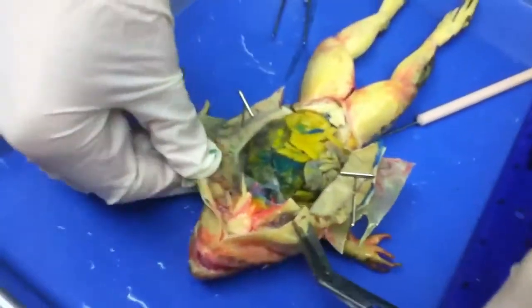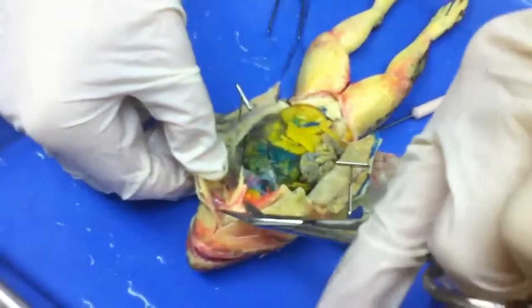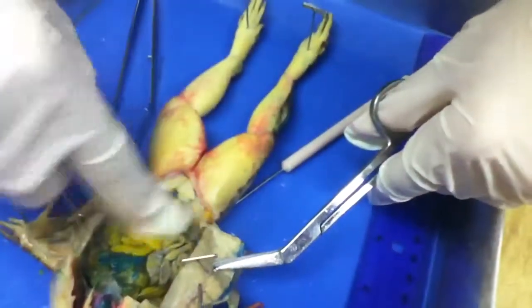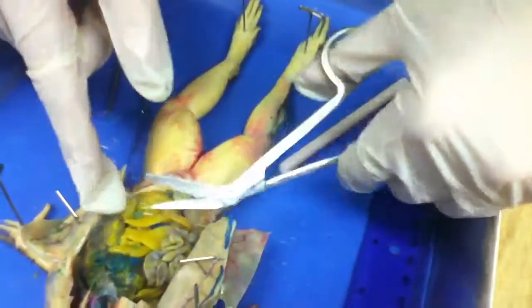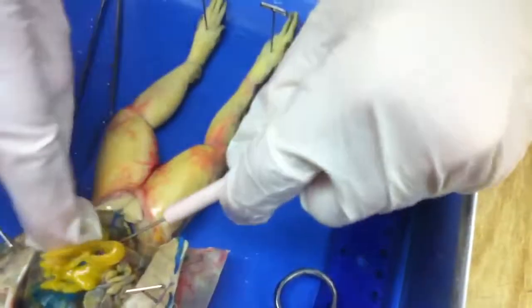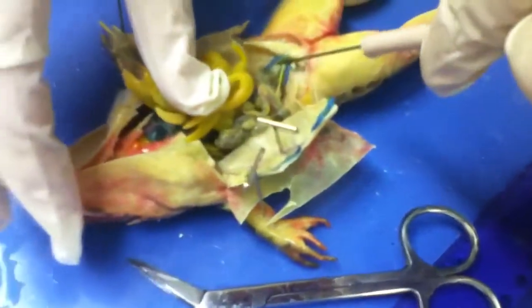Poor frog. Oh, look, there's his esophagus. Okay. I think you cut it. I do not see any eggs, but I just see his... wait. No, I think our frog's male. Alright, so no eggs? No eggs.